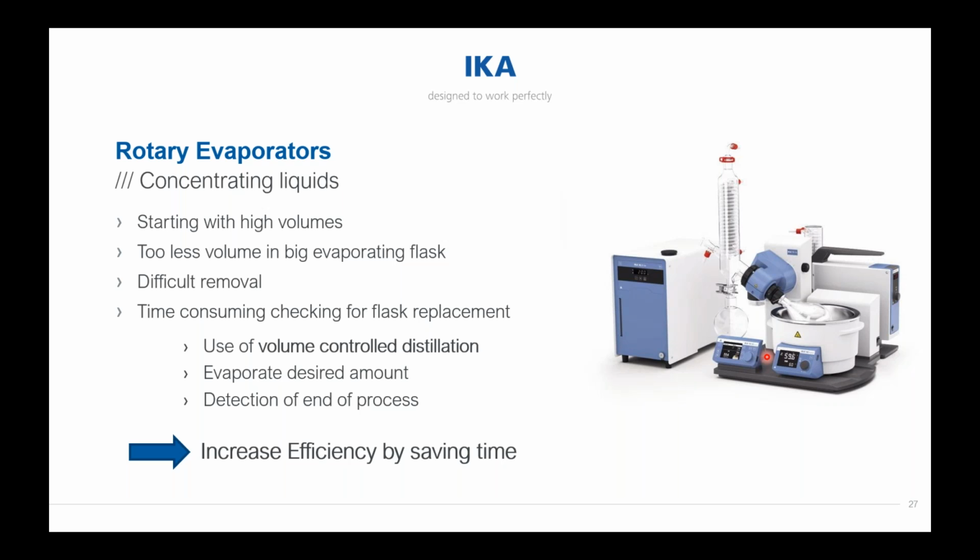So you don't have to check anymore, because if the system is finished, it will just directly move up. You will get the acoustic signal, and this gives you the possibility to save time by just changing the evaporating flask at this time after you've seen or heard the acoustic signal or seen this lift operation. So this gives you also the possibility to detect the end of the process and to increase the efficiency by saving time.